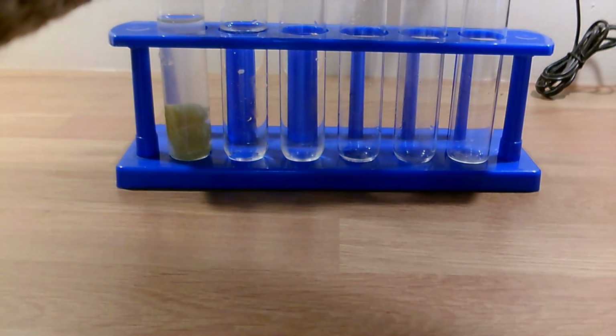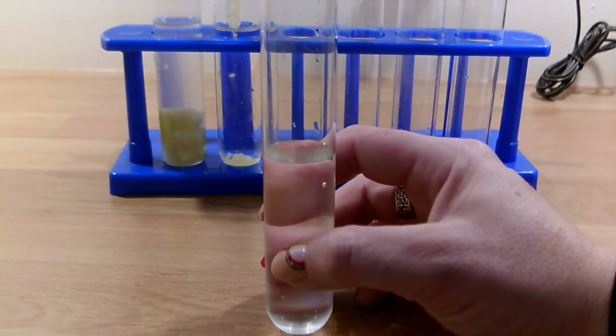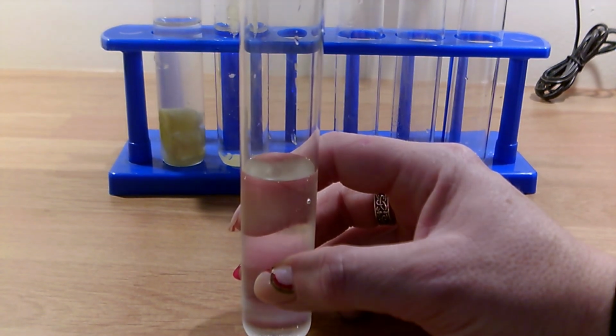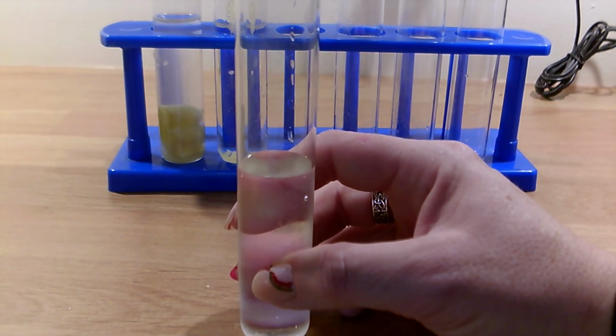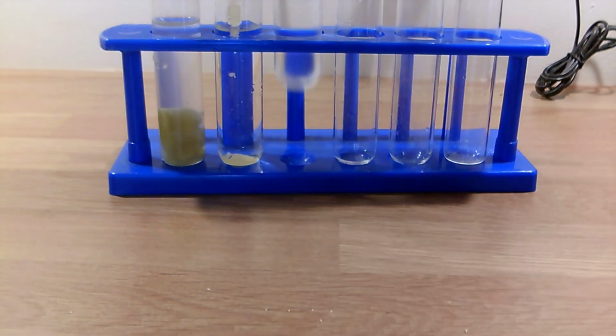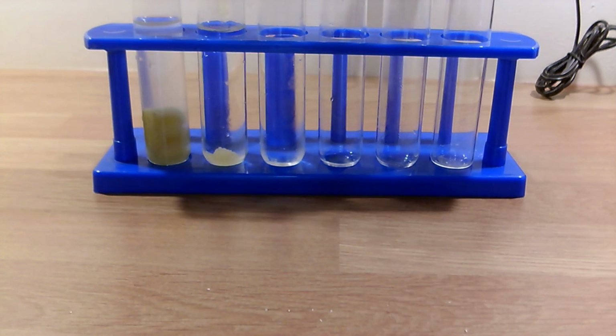So we've also got a jelly baby and some honey and some sugar, since we know that the jelly baby and the honey will contain glucose, so should give us a positive result. We are putting a yellow jelly baby into the first test tube, and then we are squeezing a bottle that has got the honey in it into the second test tube. And then we are using a spatula, which is a rectangular metal science spoon, to put the sugar into the last test tube. We have got to put the sugar into the test tube lots of times because there isn't very much of it going onto the spatula each time.